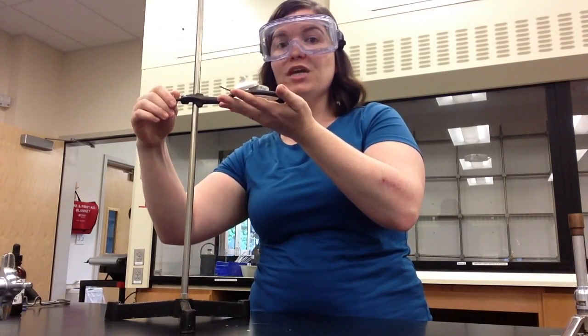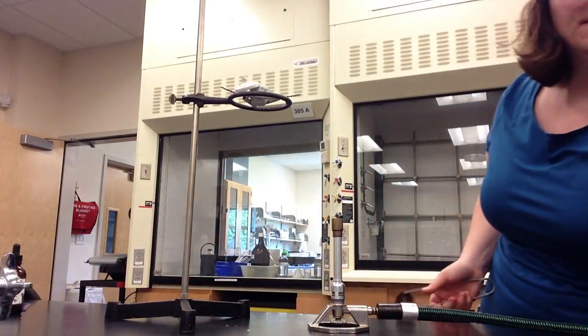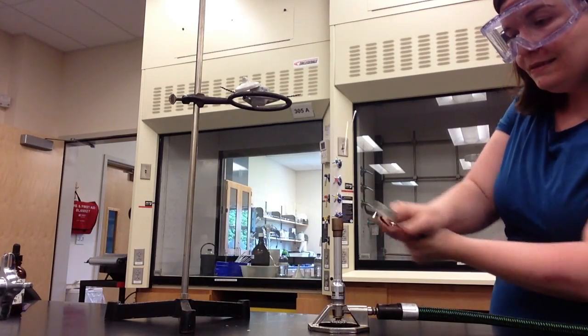You're going to begin by gently heating the potassium chlorate in the crucible for 8 minutes. To gently heat, the crucible should be 6 to 8 centimeters above the inner cone of the Bunsen burner flame. I'm going to light my Bunsen burner. Turn on the gas. Use my striker to light the Bunsen burner.